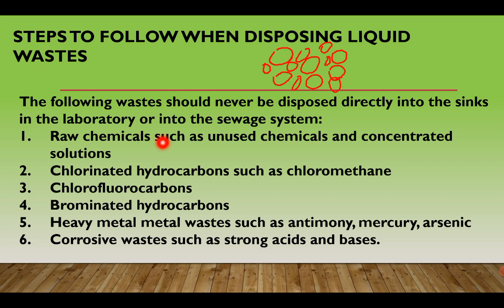Raw chemicals such as unused chemicals and concentrated solutions are by no means supposed to be disposed of directly into the sinks in your laboratory at all. So don't dispose of these directly into the water sinks.